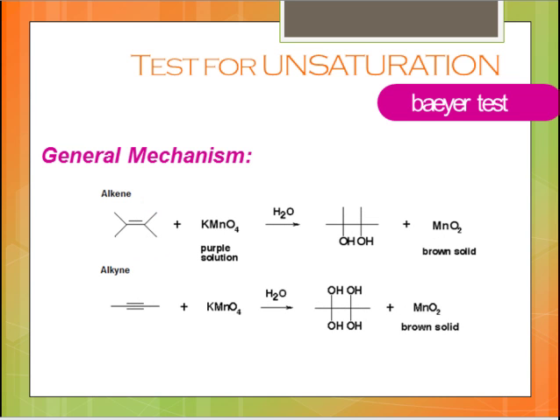In here, we see the reaction mechanism for alkenes and alkynes with the Baeyer's test, which uses an aqueous potassium permanganate solution. With an alkene, the pi bond is broken and hydroxide ions are attached at the cis position. Also, the brown precipitate seen is composed of manganese dioxide.